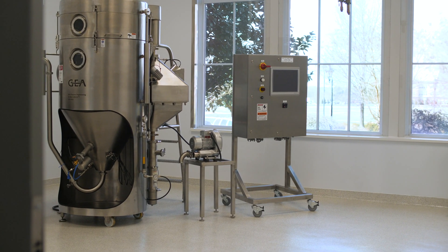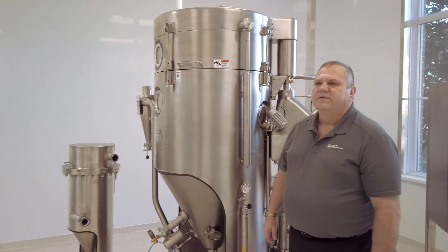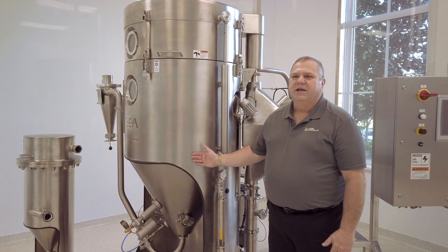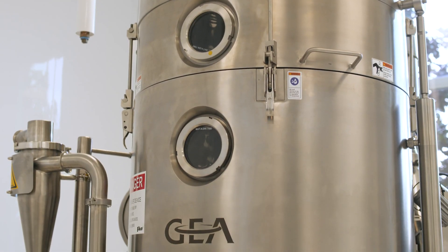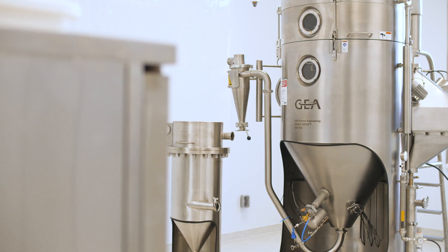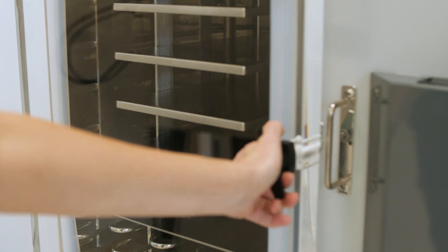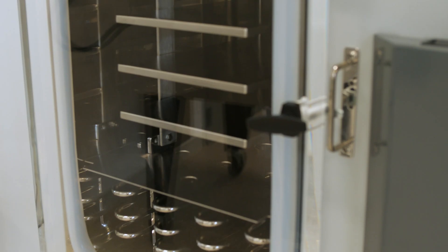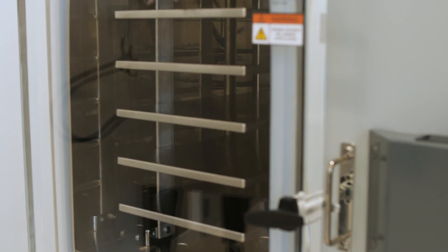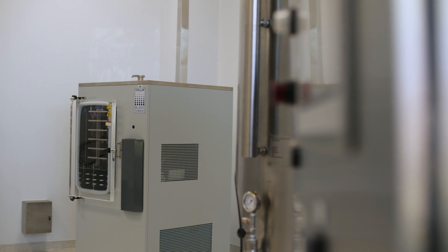We're in the drying room of the Food Innovation Lab, and in this room we have several different configurations of drying equipment typically utilized to manufacture food ingredients. The first superstar in this lab is the GEA spray dryer, capable of drying just about any type of powder and removing about four to eight kilograms of water per hour — it's highly configurable for a large number of different products. We also have a freeze dryer in this facility. Both are equipped with computerized methods that allow us to scale from small scale to full-scale production easily. Freeze drying is typically used for products that are much more sensitive to heat.